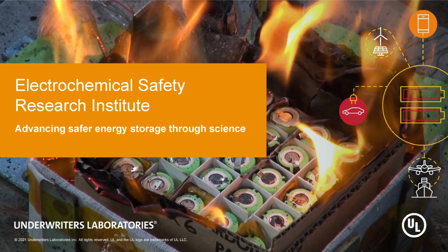This is a video to show you how to do destructive physical analysis of an 18650 cylindrical cell in a safe manner. And this video is produced by the Electrochemical Safety Research Institute at Underwriters Laboratories.